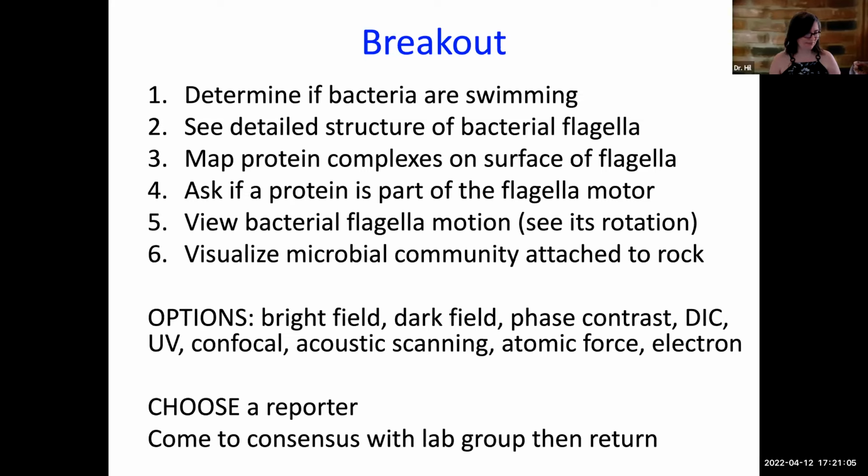Megan, go ahead. We decided on confocal, just for precision issues, because it is one of the more precise light microscopes you can use, and just because the flagella are so small. So tiny, yeah.